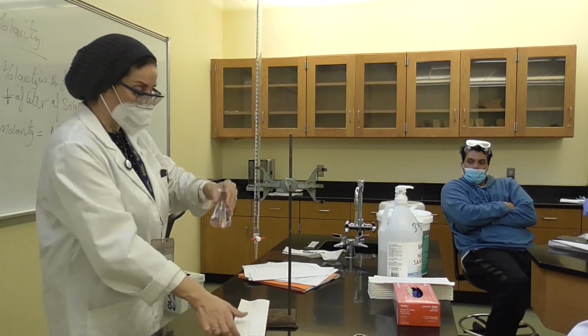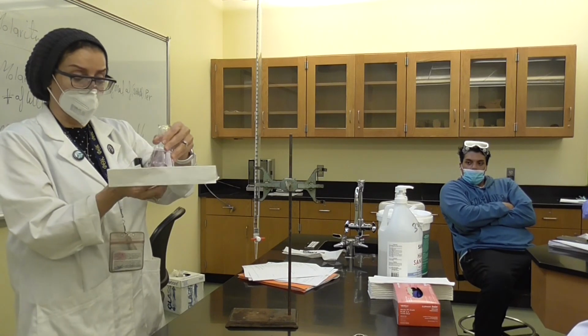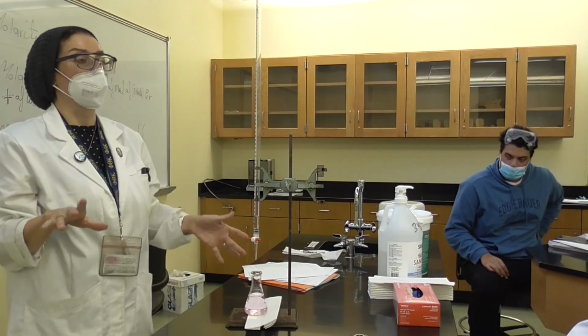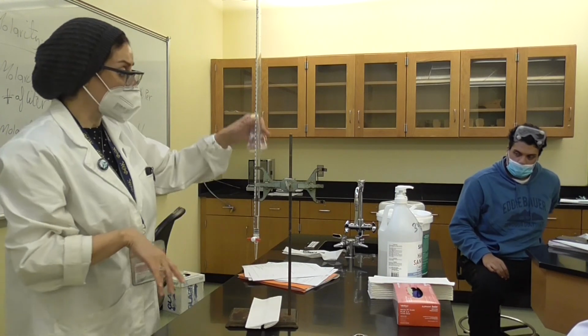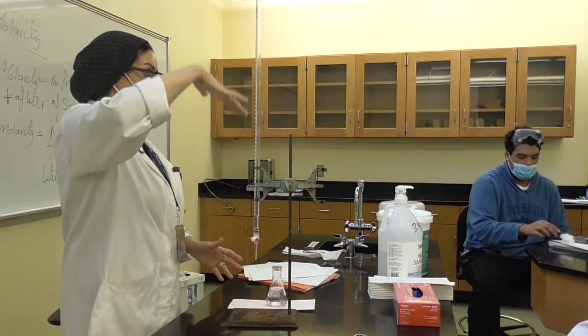So as long as it is still there, that's why it's better to put a dark or white paper underneath it, or this paper towel, and then we are reading it. So the reading here goes up to 48. So that's 48 milliliters that we dispensed, and the color is still there and is not disappearing, okay? So after you finish the first one, you do the same thing for the second: refill the burette back to 0 with more sodium hydroxide, and start the titration, okay?